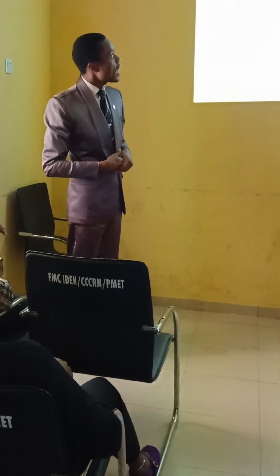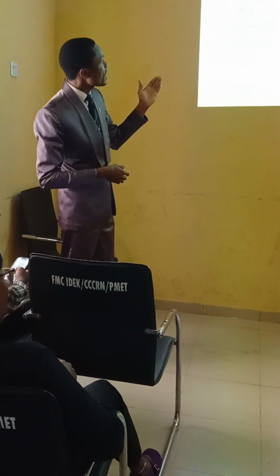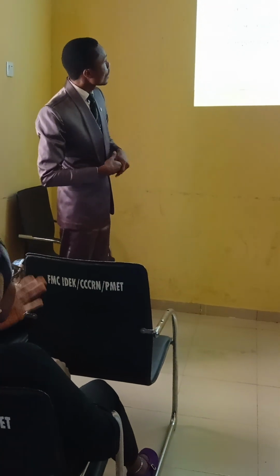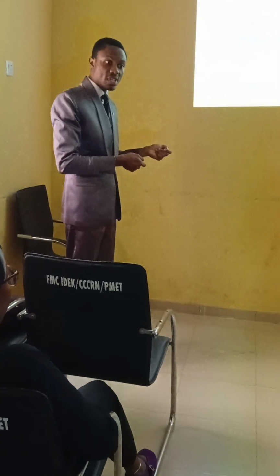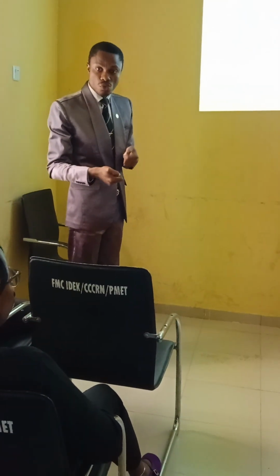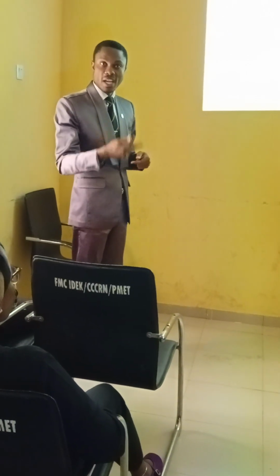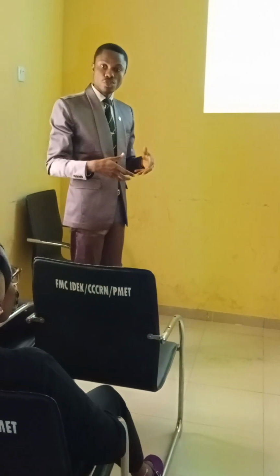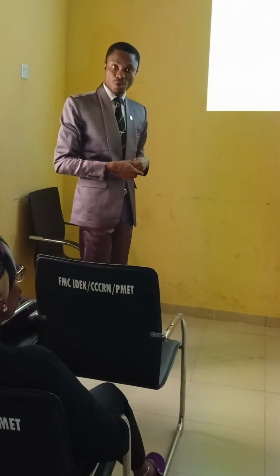So these artifacts can lead to misinterpretation. Artifacts mimic pathology and they hide pathology in some cases. So even if a tissue has a pathological condition, because of the introduction of that artifact, some of those pathological conditions may not be seen. Then it can also lead to a false negative slide due to poor preparation.